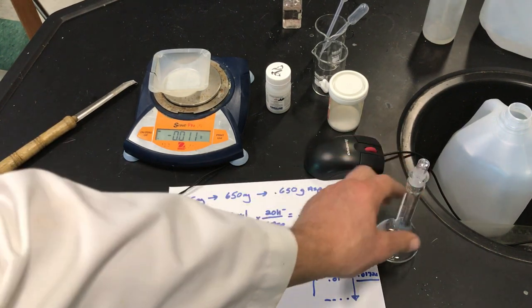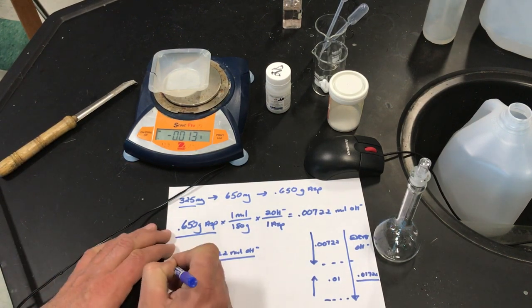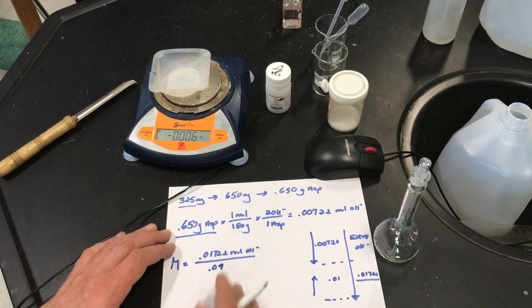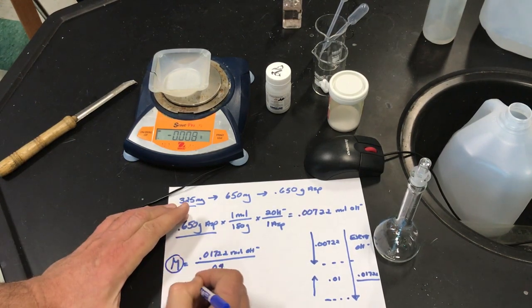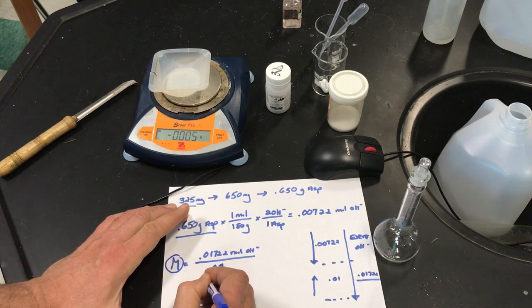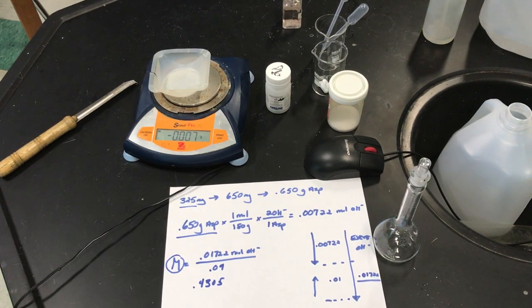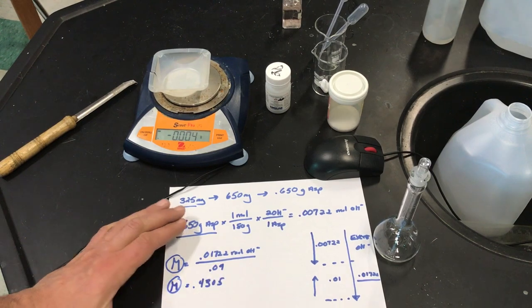I want to use 40 milliliters of this. Since molarity equals moles over liters, with 0.04 liters, what was your value for the molarity of your solution? 0.4305. So that's the concentration of the base we want to make. We're not going to make 40 milliliters exactly — we're going to make 100 milliliters, so we need to solve for the moles needed.